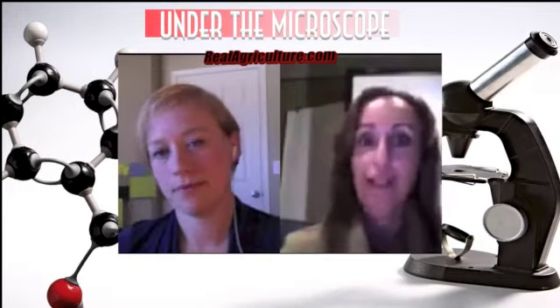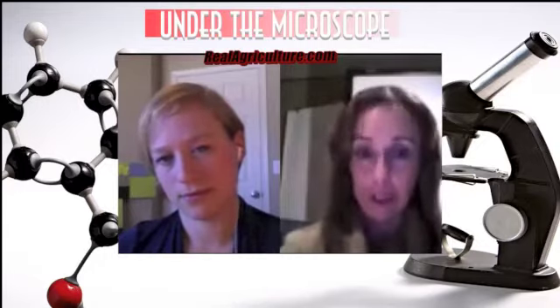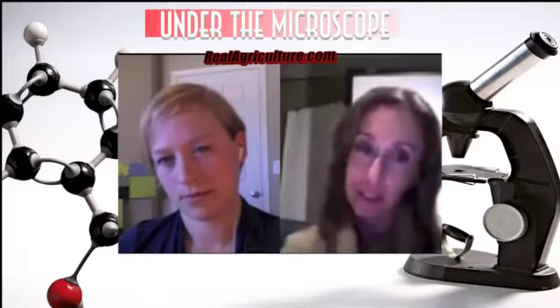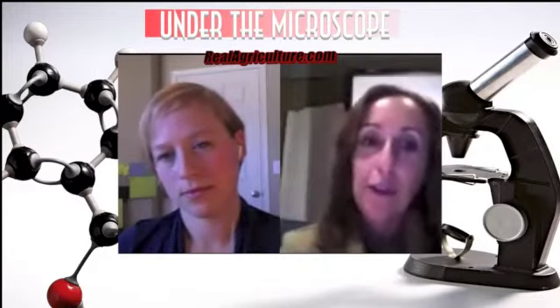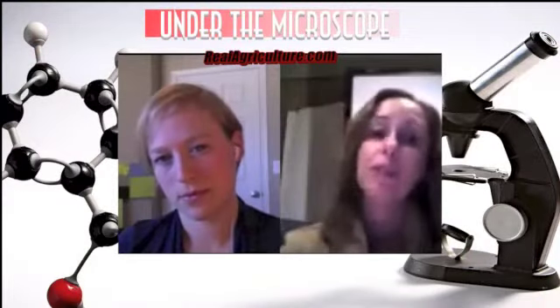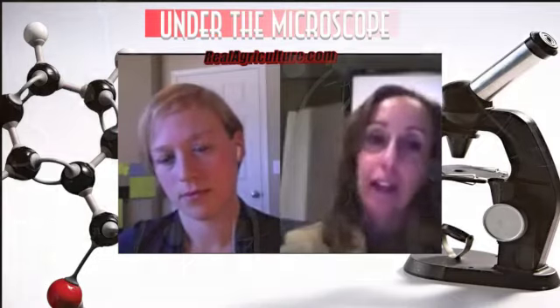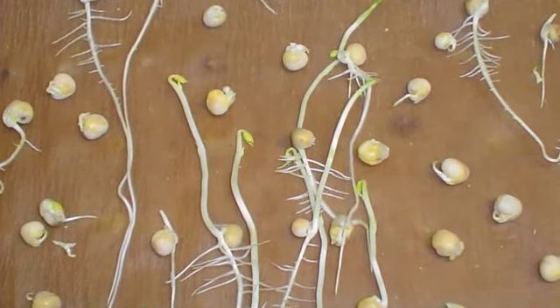Absolutely. So now if you're a producer that likes to go in early, you have a lot of acres to cover, so you're going to be putting your peas in very cool conditions, we highly recommend a cool stress test. And how that is different from the germination test is that we plant it in the same media, which is a roll towel. We give it adequate moisture so that it will sprout. But then we put it in our chill chamber, which is 7 degrees Celsius and in the dark for 7 days. And then after the 7-day period, we move it into our warm chamber for another 7 days. So what it will do is it will start growing. And from there, we can evaluate how many are vigorous plants, how many are non-vigorous, and finally, how many did not even sprout.